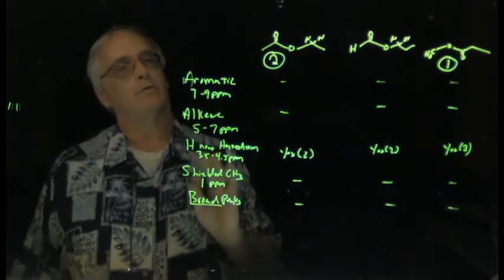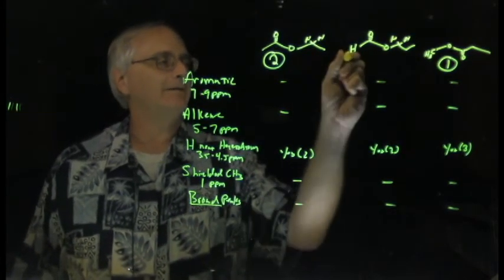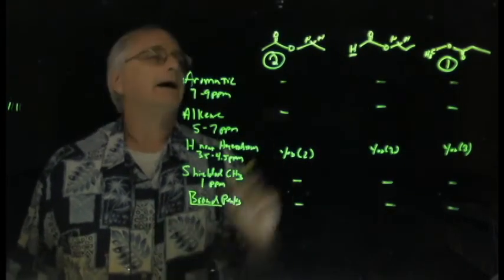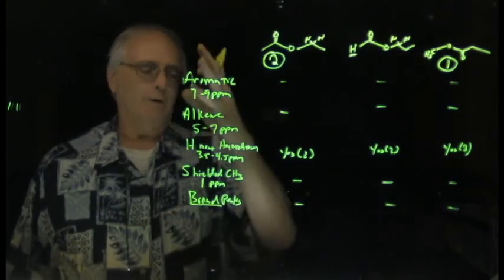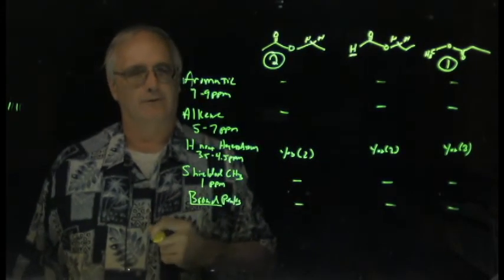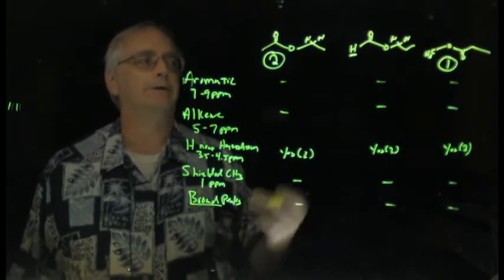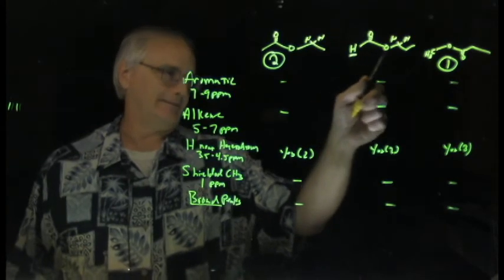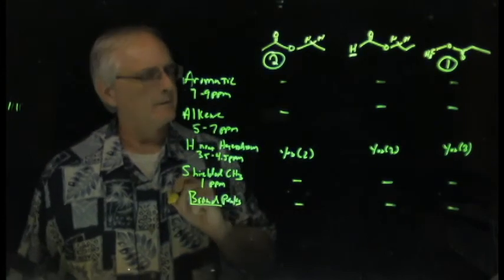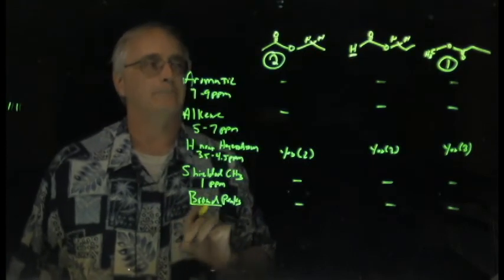But there is one other bit of evidence to extract out of all this, and that is this hydrogen here. That's an odd hydrogen. We haven't seen that one before, and it's not common that you see a hydrogen like that, a hydrogen sitting on a carbonyl. So while I call these my 5 best friends, there are a few others that I keep in the back of my mind for referencing, sometimes my special friends. An aldehyde, hydrogen sitting on a carbonyl, which is kind of what this one is. It's more of an ester here, but hydrogen sitting on a carbonyl, that's a little bit odd. Aldehyde is by far the most common functional group that will have that. No other functional group possesses it.